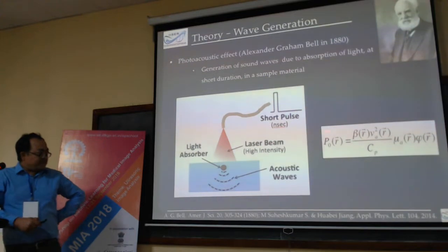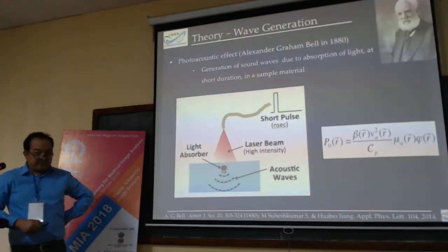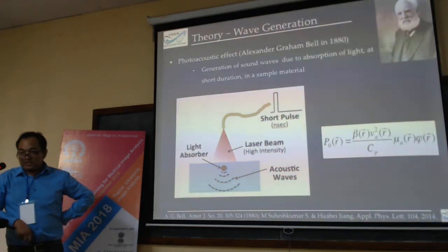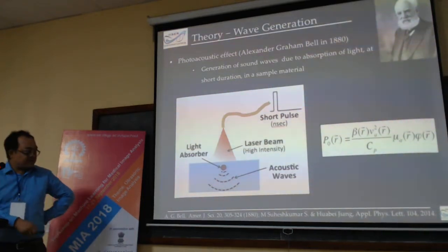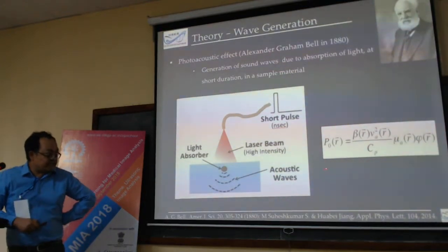So from the experimental measurement of this photoacoustic signal, one can derive whatever parameters are involved on the right hand side. This is how the physics plays a role. From this signal, what are the parameters that we can derive? How do we characterize the photoacoustic signal?